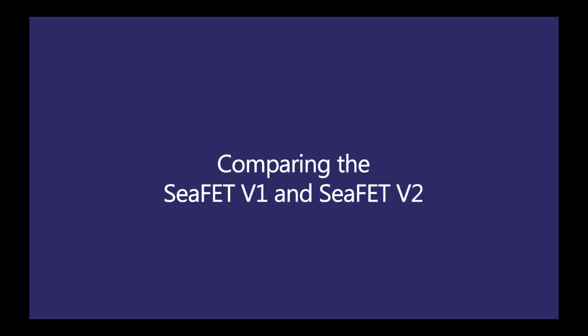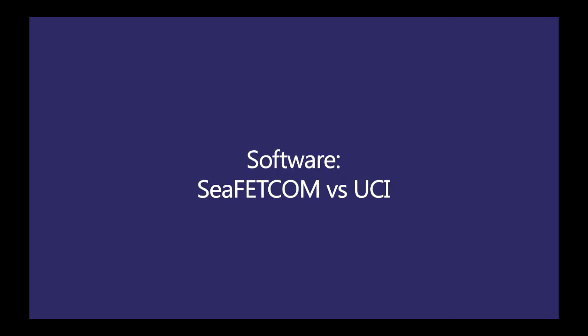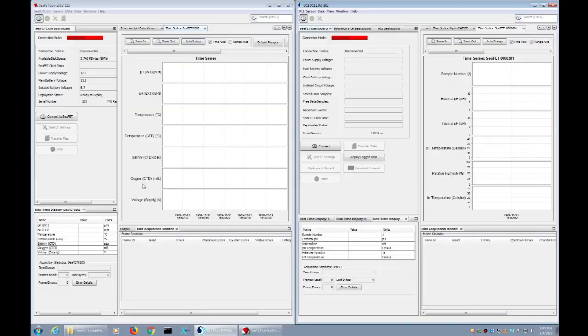In this video, I'm going to walk you through important differences between the SeaFET V1 and the SeaFET V2. We'll start by comparing the software that you use to connect to the SeaFET V1 and the SeaFET V2.